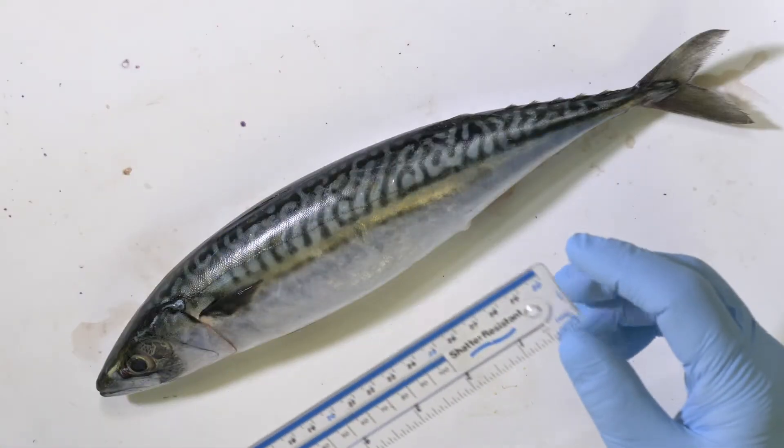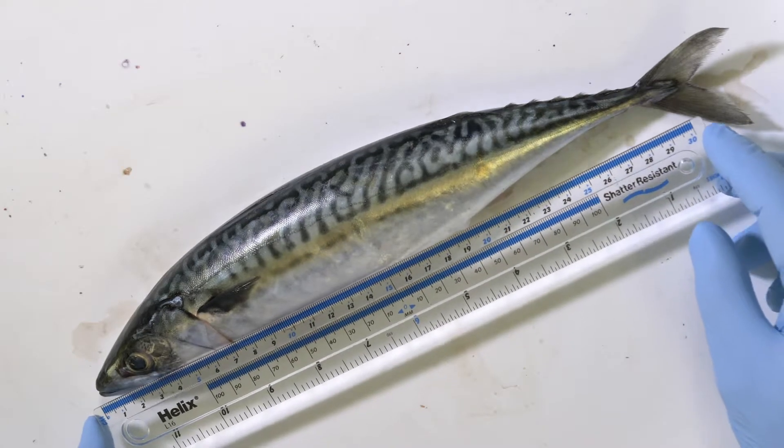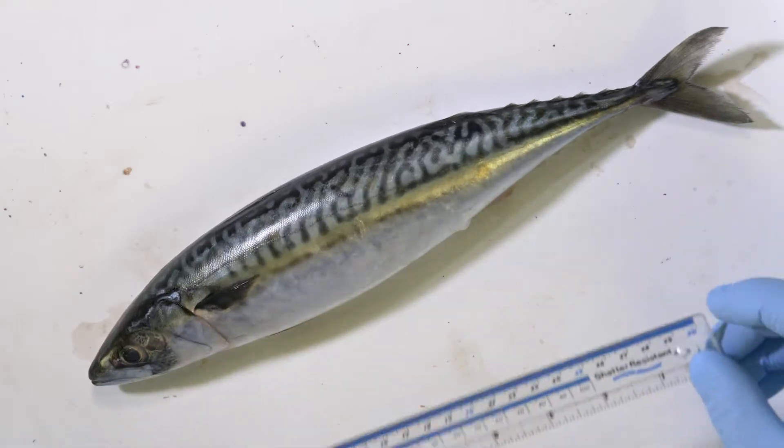An obvious measurement to take is to measure the length of the fish, and we would normally do this from the tip of the mouth to the fork of the tail. So this fish is about 30.5 centimeters. You could also weigh the fish and record the weight.